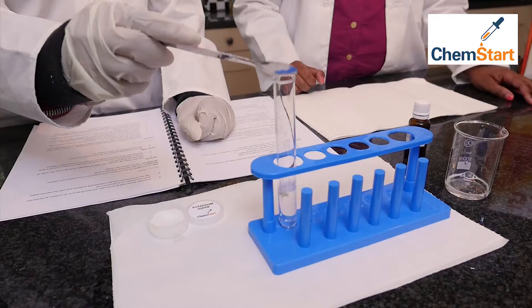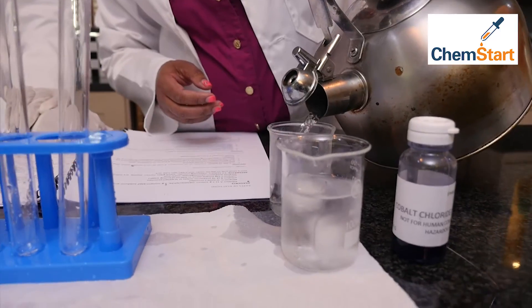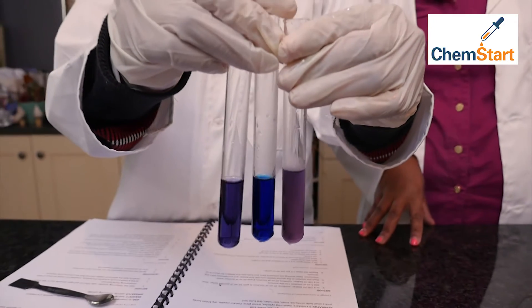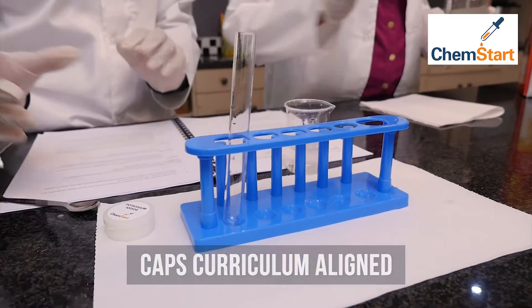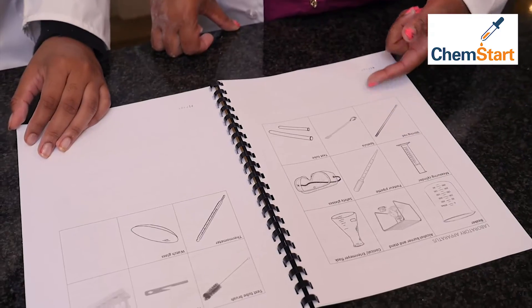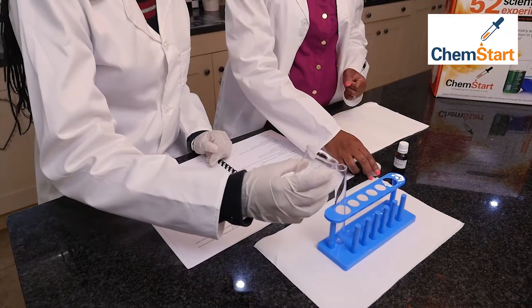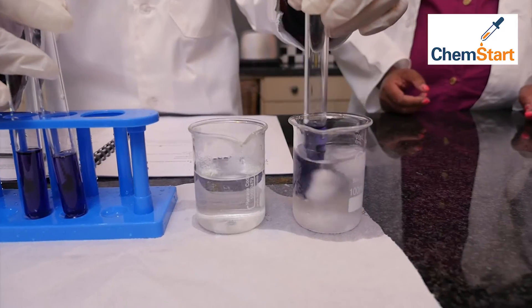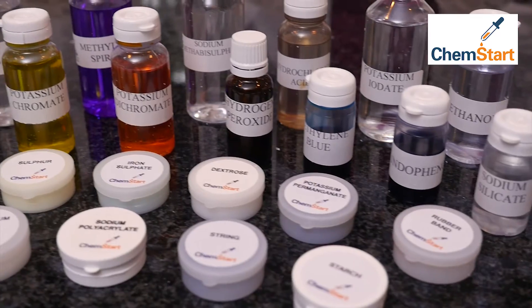Experiments range from elephant toothpaste to chemical volcano, and from iodine clock to chemical robots. ChemStart lines up with the CAPS curriculum and includes everything you'll need to get going — diagrams that are easy to follow with step-by-step manuals and even practice questions to make sure you've grasped the concepts. There are even refill packs so you can redo some of your favorite experiments.